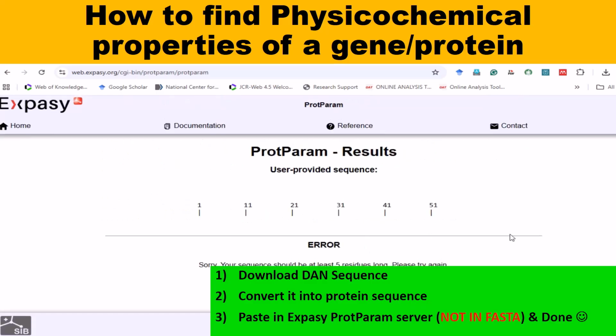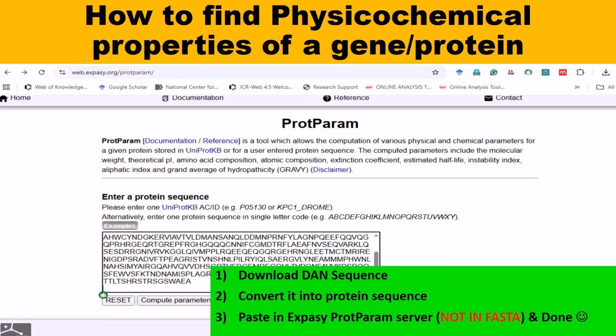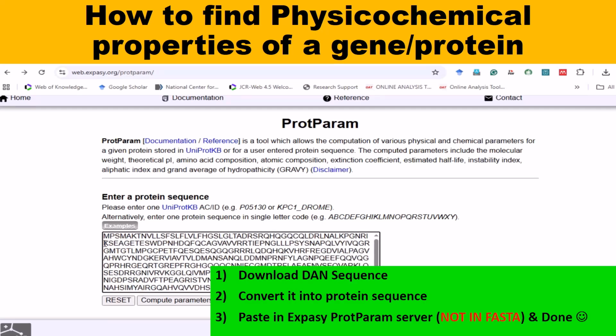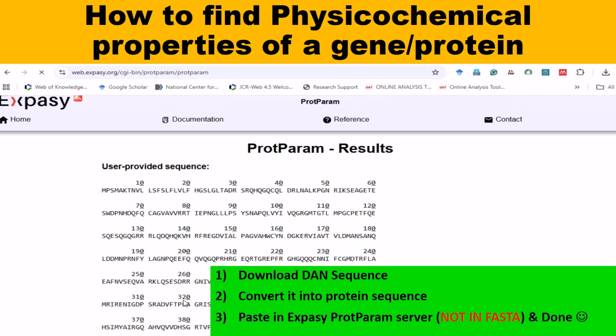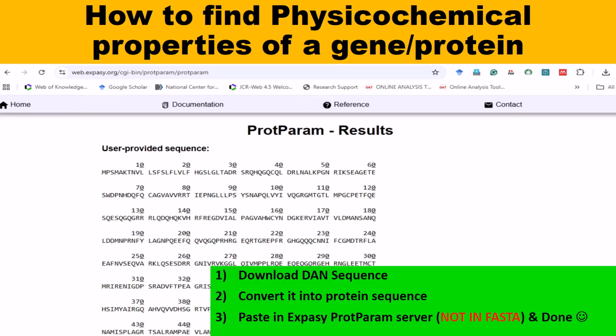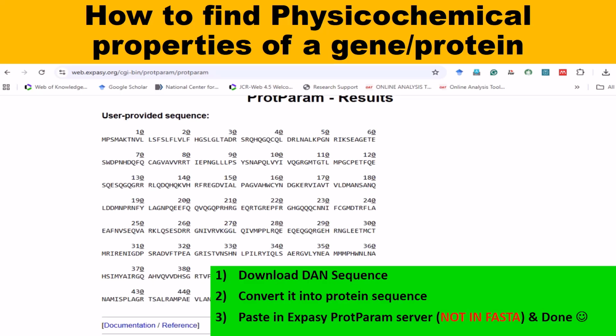But oops, it gives an error. Why? Because you have to take care of this problem: when you paste your sequence, you should always paste it in a non-FASTA format, which means that you should remove the FASTA sign from the sequence. Then again, click it and it will give you the whole lot of parameters, which are the physicochemical properties.